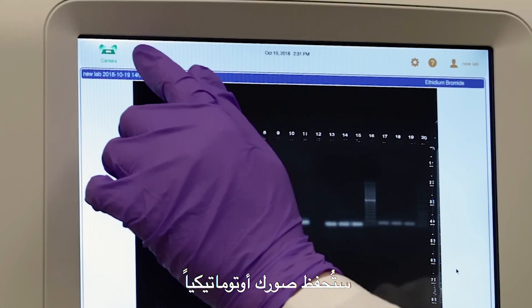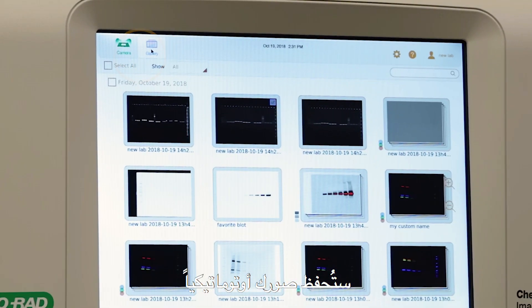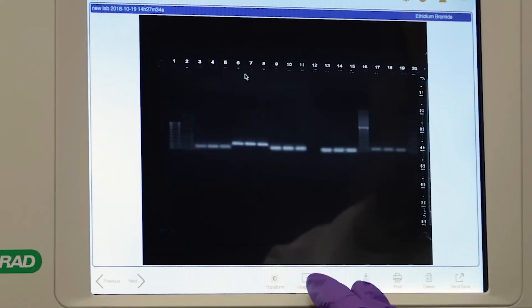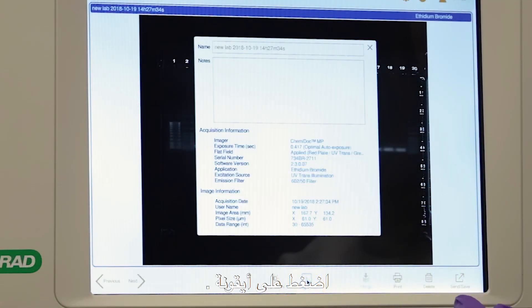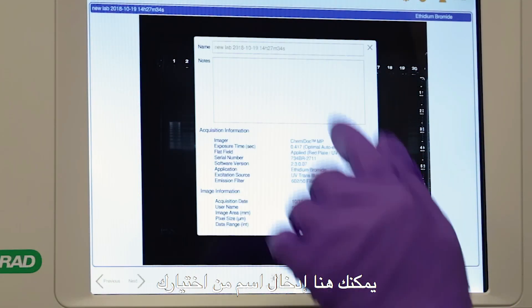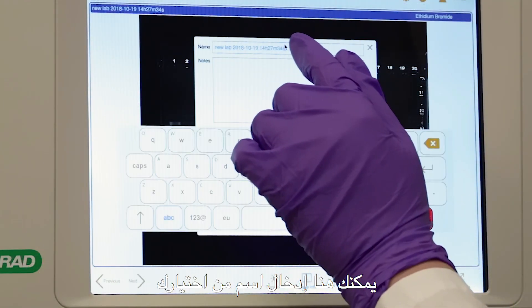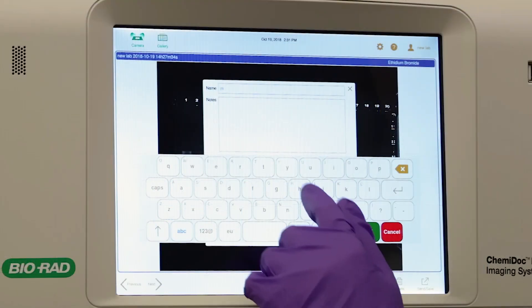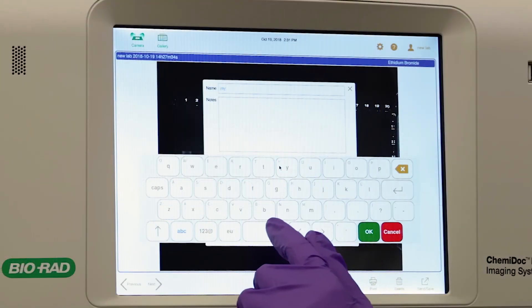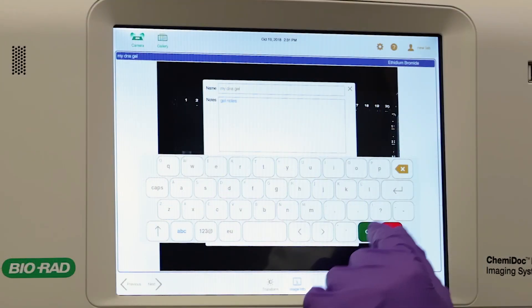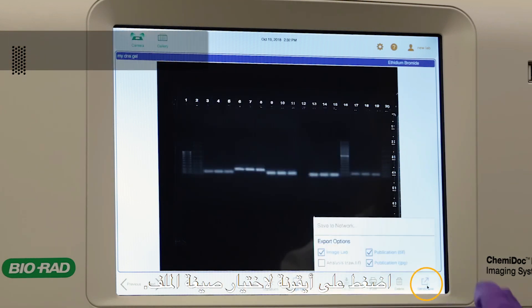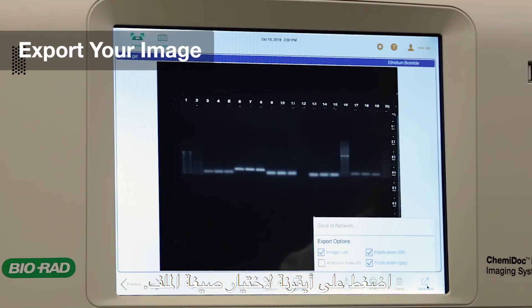Your images will be automatically saved and exported to the gallery. Tap the image info icon. Here you can enter a custom name and notes about your image or experiment.